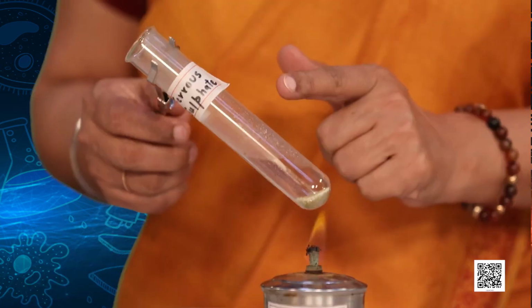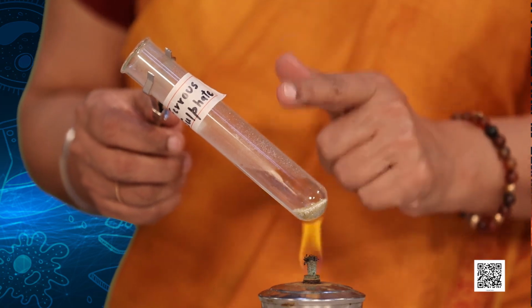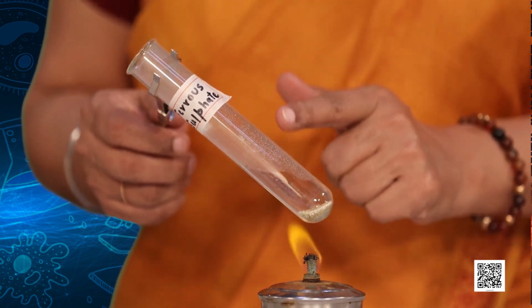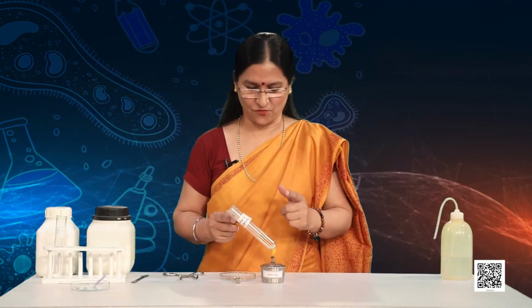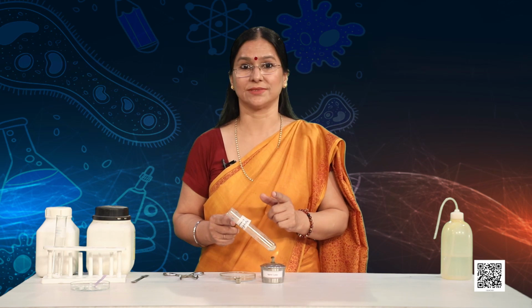Now friends, can you see these water droplets on the inner surface of boiling tube? From where have these water droplets come? Well, the ferrous sulfate crystals, that is FeSO4.7H2O, lose water when heated, and color of the crystals change.